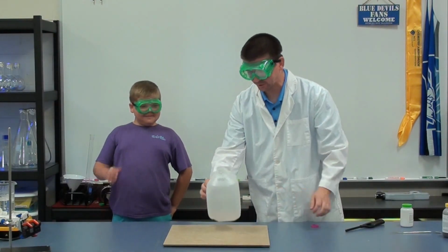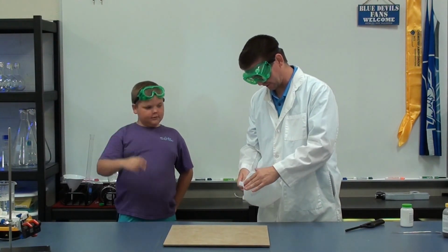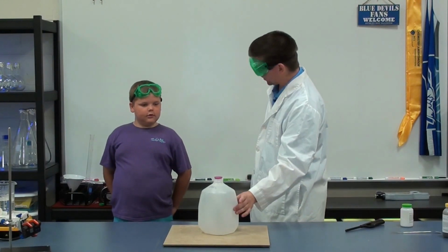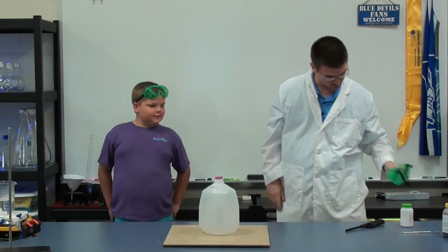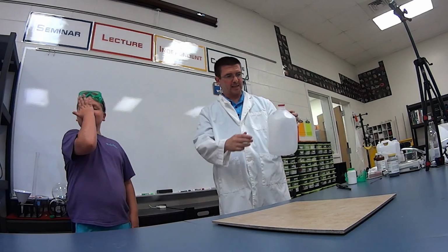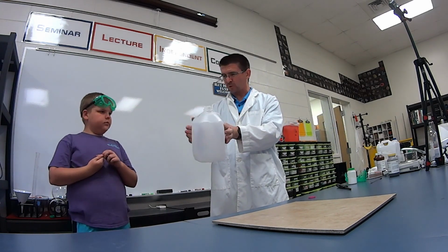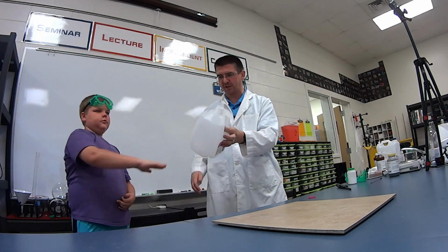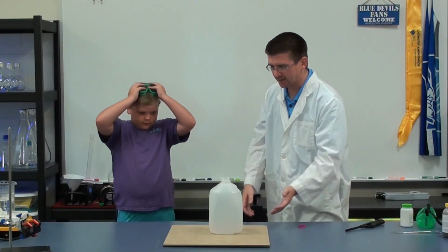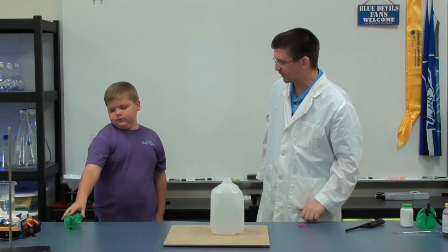Now, obviously, quite a bit different. Let's put that on there just in case any's burning on the bottom. That'll put it out for us, but quite a bit different than our alcohol burning in the evaporating dish, right? Mm-hmm. Okay, instead of burning over 3, 4, 5 minutes, it burned very quickly. It burned very completely. You can feel that jug's quite warm now, just from having that blast of fire through it. But what we did, we had complete combustion of our alcohol by igniting the vapors. The vapors burned quickly, shot that fire out the top, made that whooshing sound.